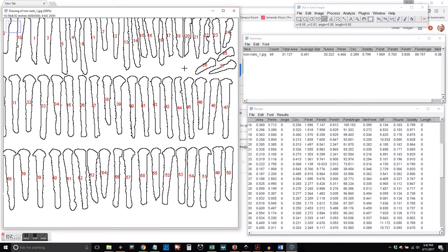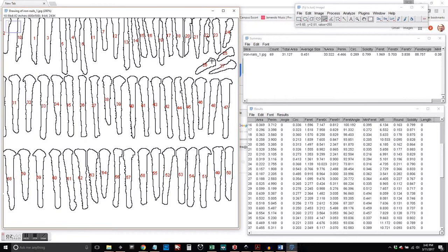So we're going to take 26. And you can see that it measures close to what the ferret number for 26 is.